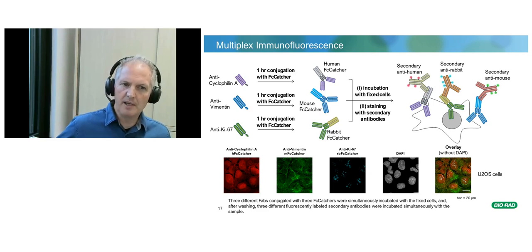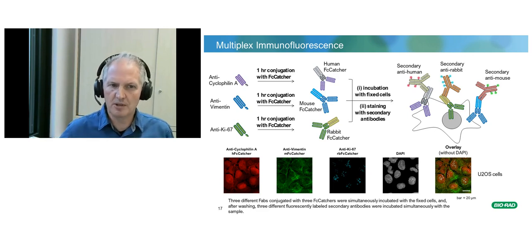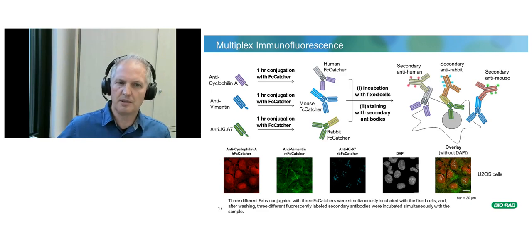So that you basically can take your human Fab and quickly convert it into a mouse antibody, to be accurate, a human mouse chimeric antibody. And then you can use your standard detection reagents, anti-mouse Fc or anti-rabbit Fc secondary antibodies, which you probably have sitting in your fridge, and you can go ahead.